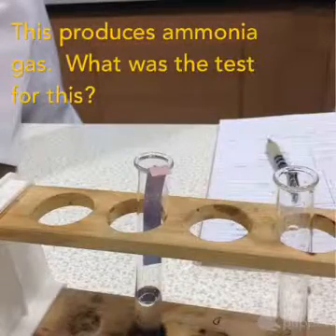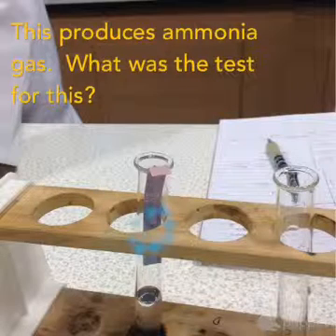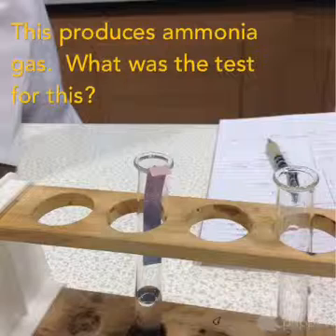Can you remember what the test for ammonia gas was? Have a look at what has happened to the colour of the litmus paper here. Remember when we started off, it started off a pink colour. That is how we test for ammonia and for ammonium ions.